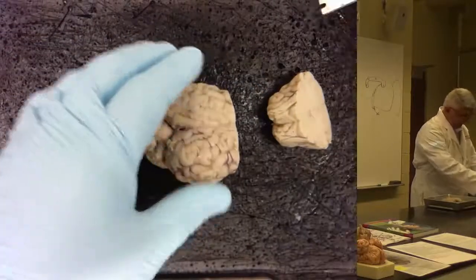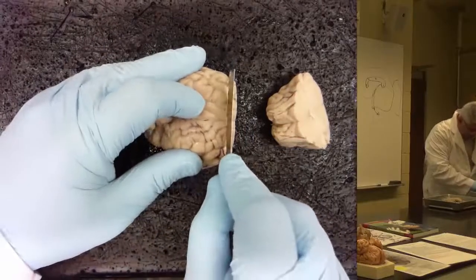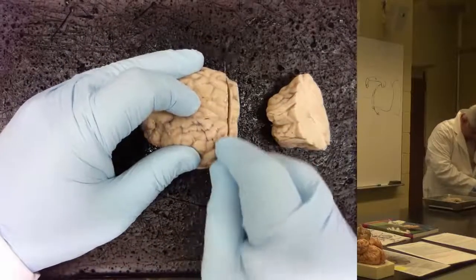So let's take another slice, and if we need to cut off the light so we can try that, but we'll take like a thin slice through here.